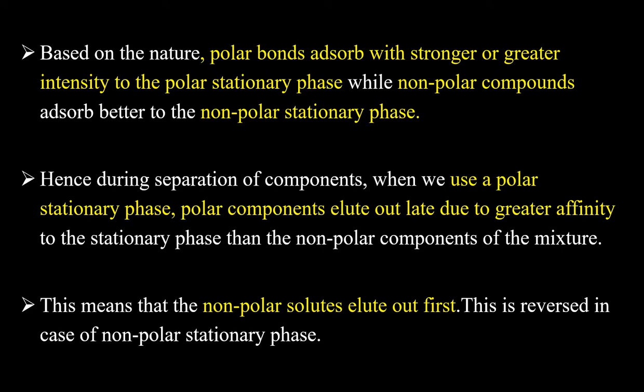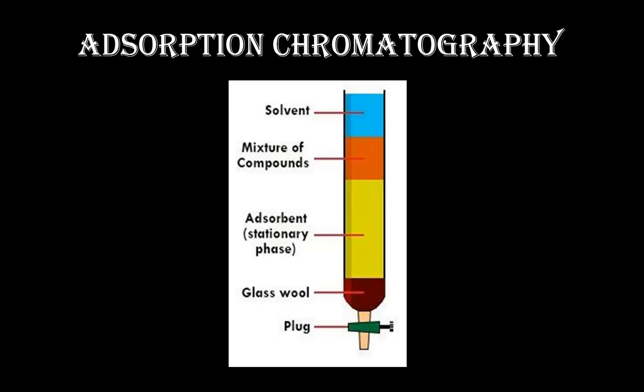Means when we use polar stationary phase, the polar component elutes out late due to its greater affinity to the stationary phase compared with nonpolar components of the mixture. This means that the nonpolar solute elutes out first. This is reversed when we use a nonpolar stationary phase.